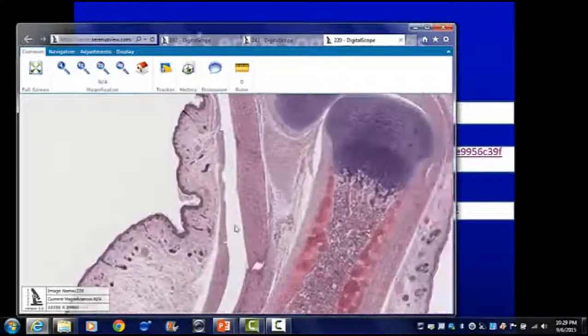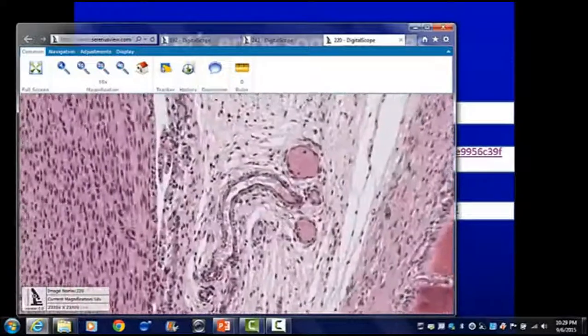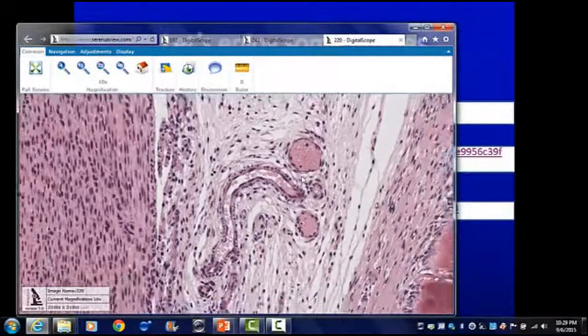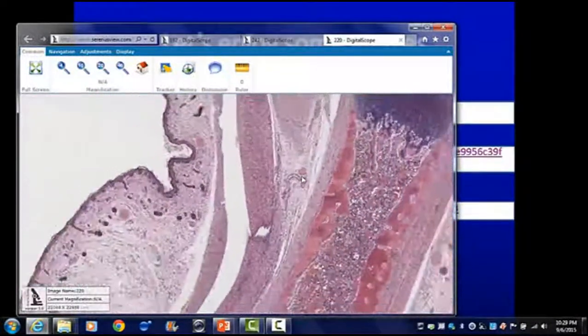Epithelium also lines blood vessels that are there. These are endothelial cells, a type of epithelium. Here, this little arteriole here, a little venule here. You can see the white blood cells and the red blood cells in this connective tissue.